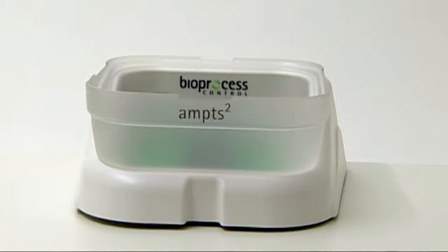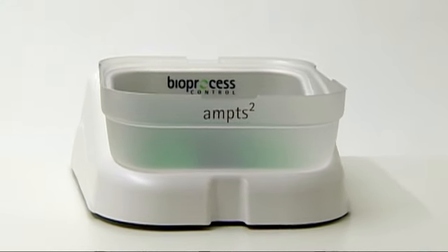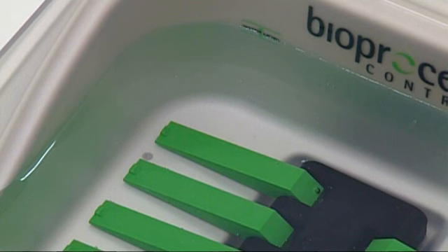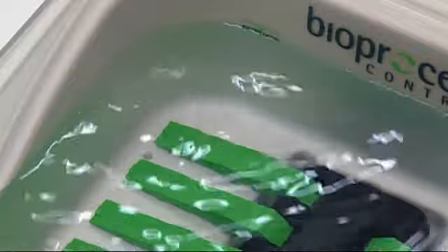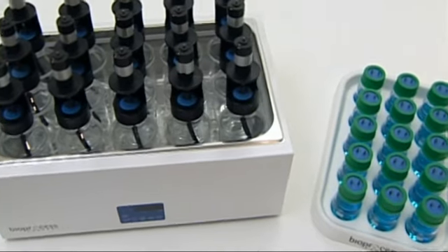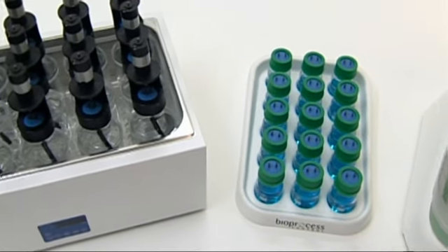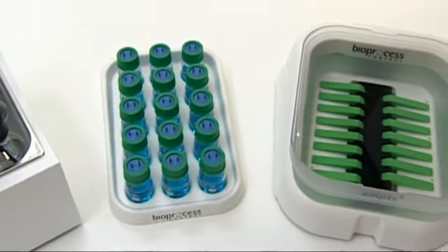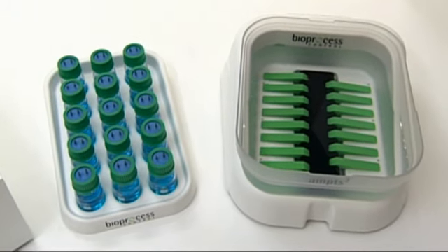The gas collection unit consists of 15 flow cells with an embedded web server. Gas flow and volume measurement is performed with real-time temperature and pressure compensation. The AMPTS-2 is a universal platform for all anaerobic biodegradability and methane potential test protocols.